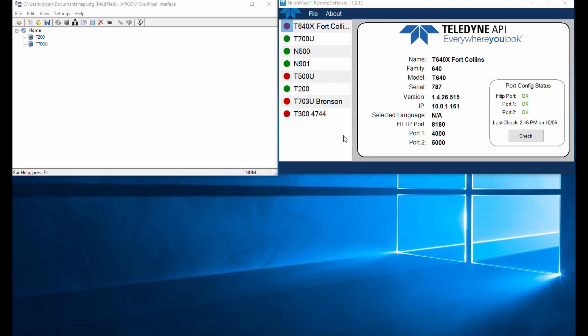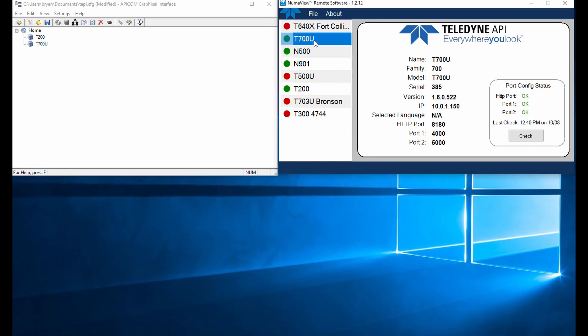So I'm going to step you through kind of a workaround for that. On the left here, I've got our legacy remote software called Apicom running. And on the right, we've got the newer Numaview remote software for our Numaview instruments running. In both of those cases, I've got the T700U set up here. You can see it's on .150 on my LAN. It's just running in the other room here.